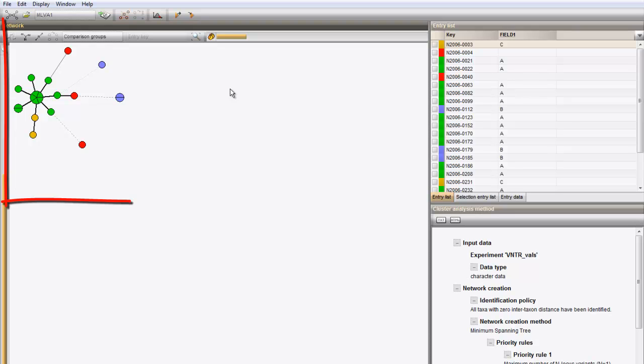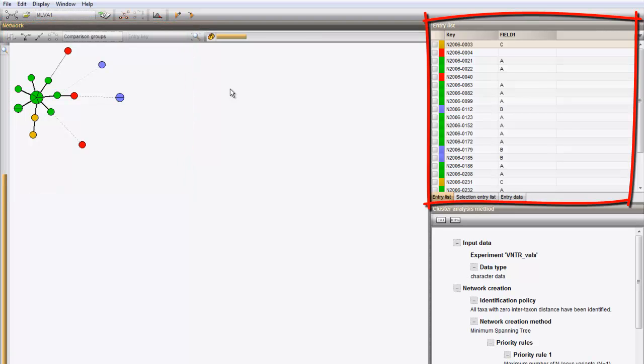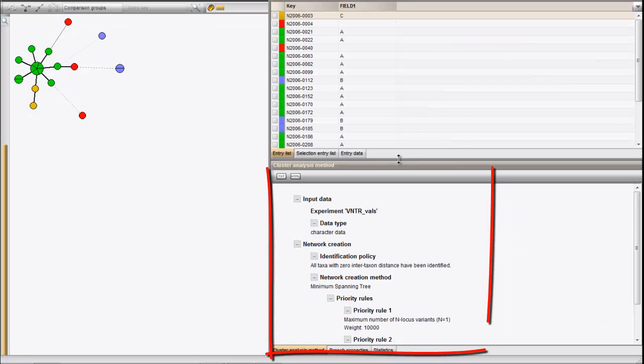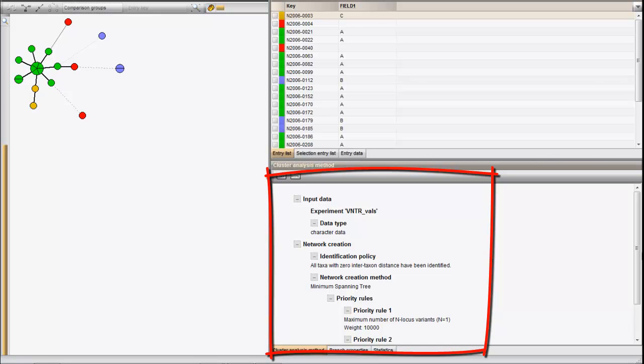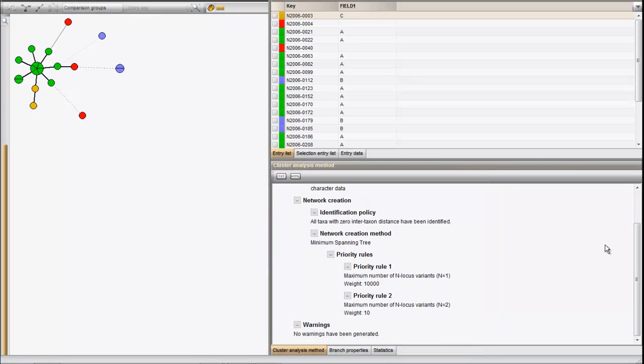The resulting window displays the minimum spanning tree in the network panel and the entry list on the right side. The right bottom panel displays the detailed settings used, for example the priority rules that result in this particular network.